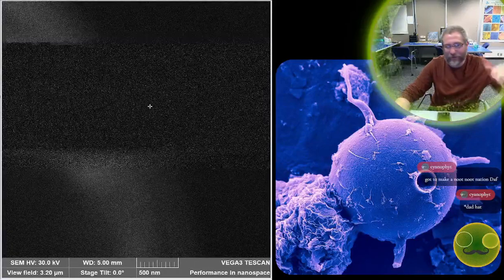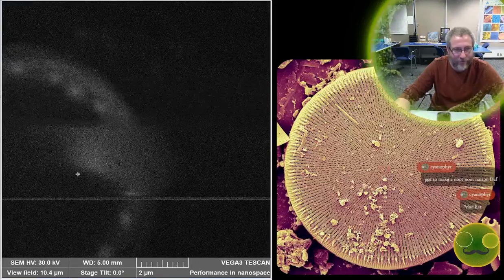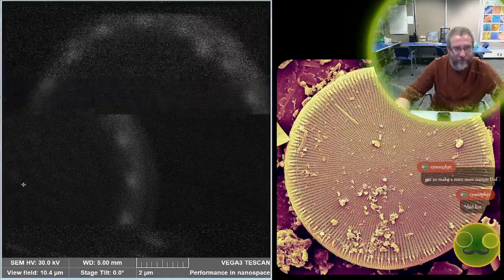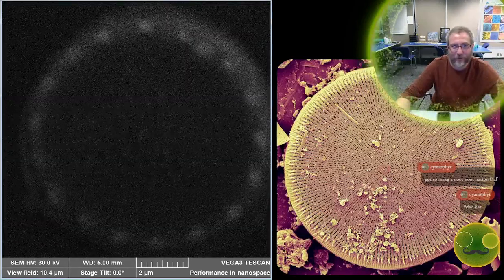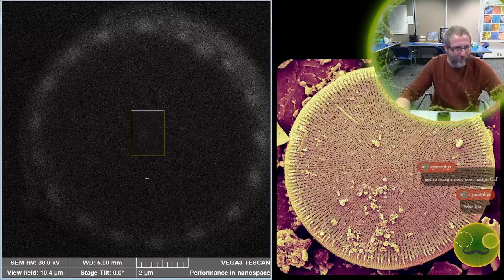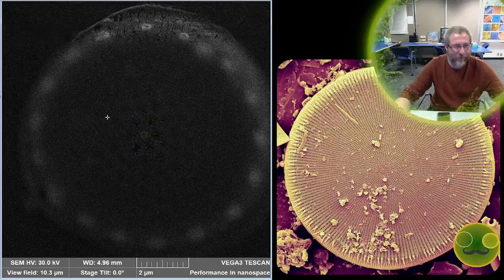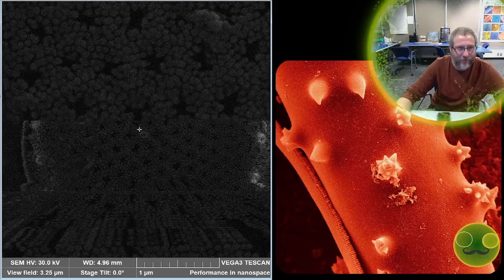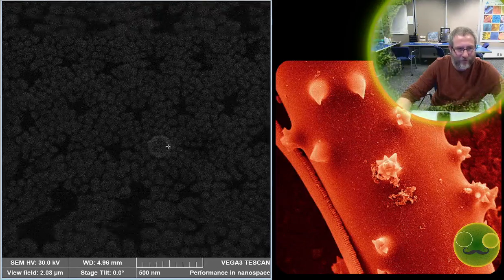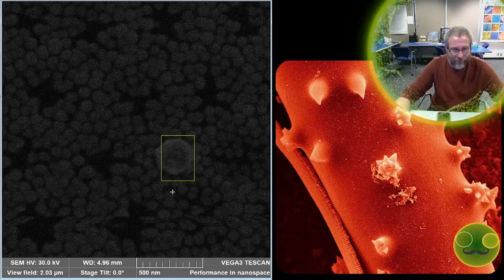I just moved the stage up a little bit, because when you start looking at really small stuff, you kind of need to be really close to it. If you think of the way that a magnifying glass works, it should be kind of obvious to you that the closer you get, sometimes the better off you are when you're looking at stuff in a magnifying glass. And the same thing is sort of true with a microscope. You want to be able to get nice and close to things. And it should improve our resolution just a little.